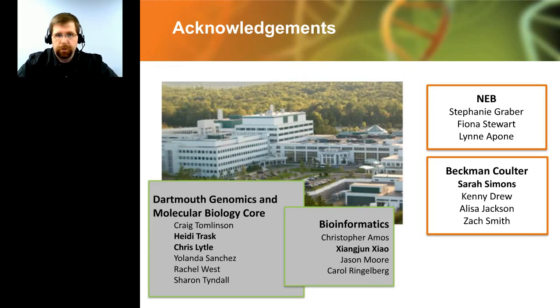So our first question involves how much starting DNA is needed for the NEB FastFrag and library prep kit and for the Haloplex protocols. I can answer that one straight off the bat. For the FastFrag and library prep set for the NEB, the method supports anywhere from 10 nanograms to 1 microgram of starting material. And for the Haloplex, we're using the kit supported 225 nanograms per sample. So that pretty much takes care of that one.